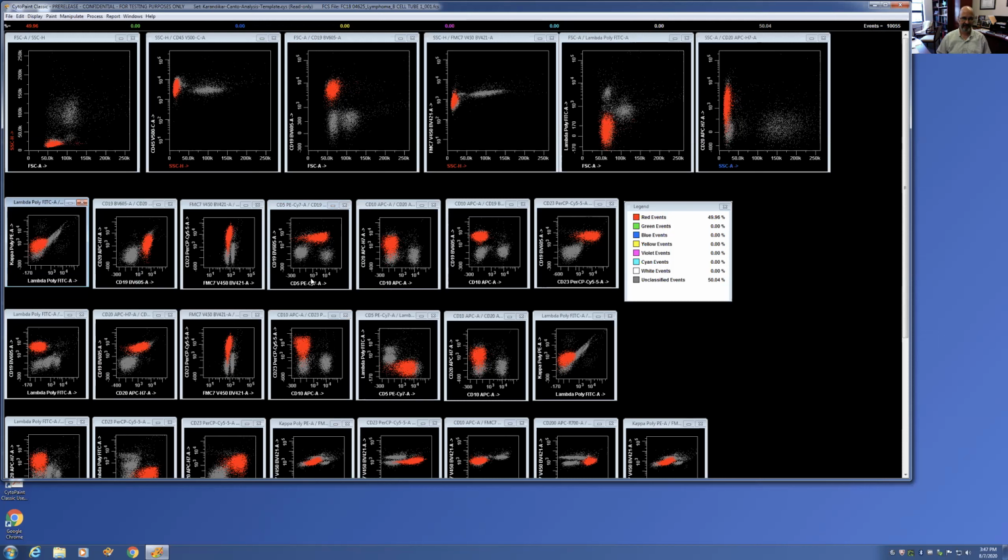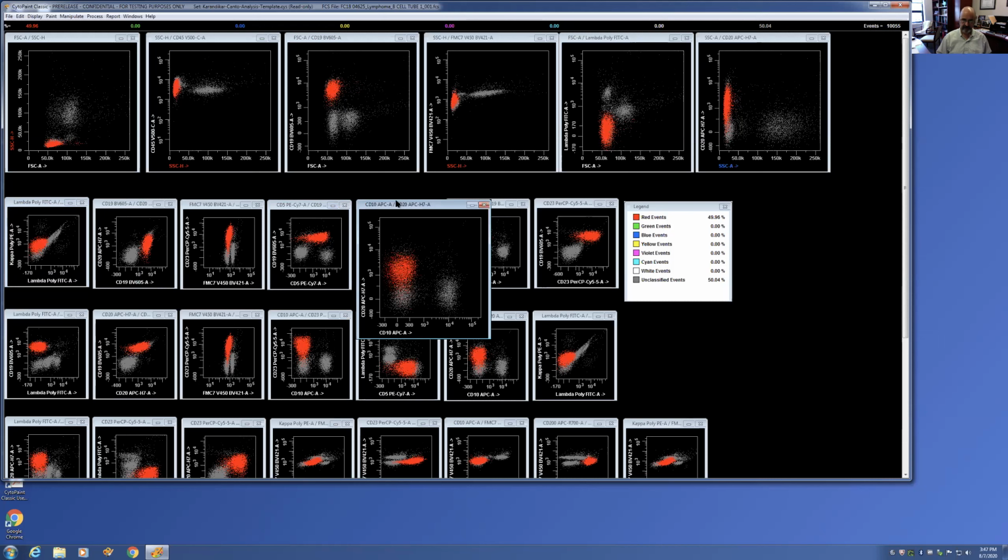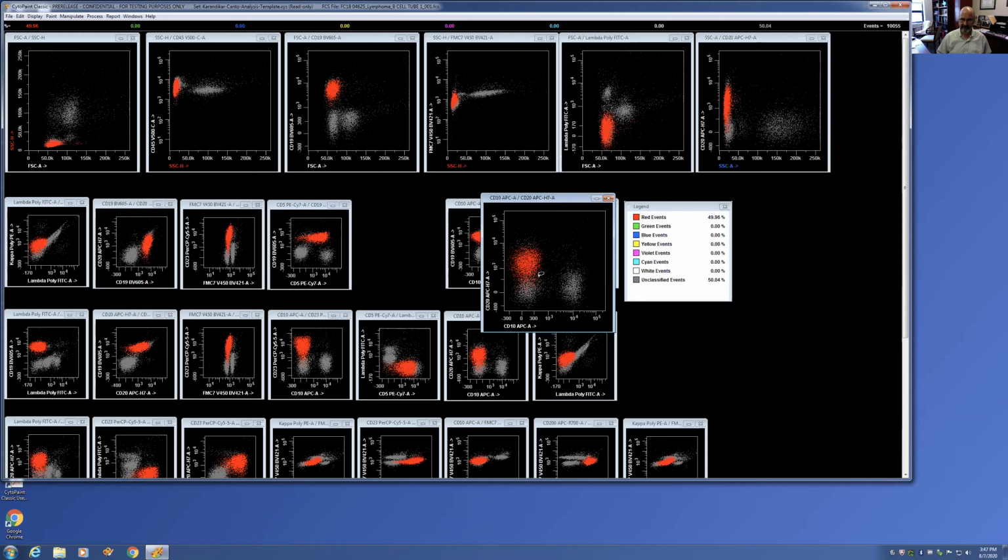And so what are the two markers we're going to look at? We're going to look at CD5, which is right here, and CD10. So seems like the population is CD10 negative. What do you think these are? So these are your granulocytes, by the way. Granulocytes are CD10 positive. So just right there, they light up. So you can undo that. And this population is also CD10 negative, but it is CD5 positive.